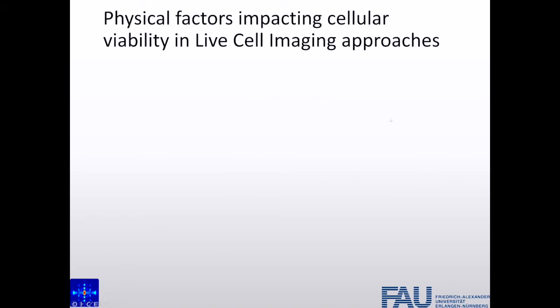So what are the physical factors impacting cellular viability in live cell imaging approaches on the microscope for the researcher? The first thing you have to think about is humidity. Humidity in incubated cell microscopes is not a problem. You just have some water either in the incubator or in the host of the oxygenation, or the carbon dioxide host. You can just control the humidity.